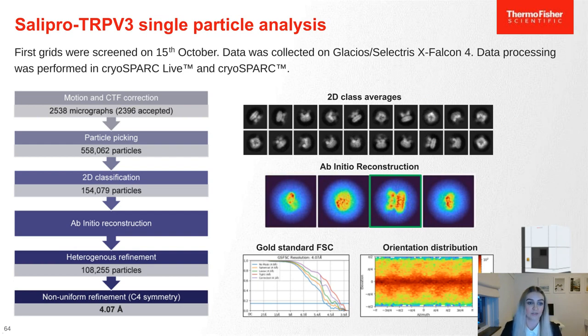So that's TRPV3. And I want to say that I received a sample from Stockholm just last Thursday, and it went under the microscope into our Glacios cryo-EM last Friday. So this is really hot off the press. This data, I made some grids and I screened them.